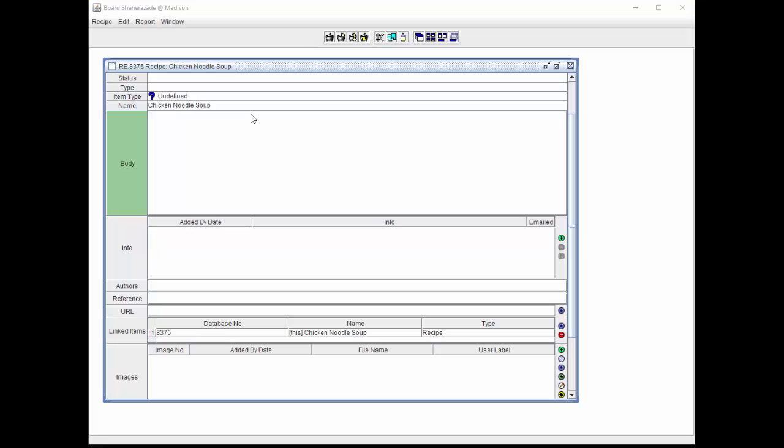In this example, body, authors, and reference are text areas. The body field can be edited by clicking in the body field. The header of the field will turn green, indicating the field is editable.